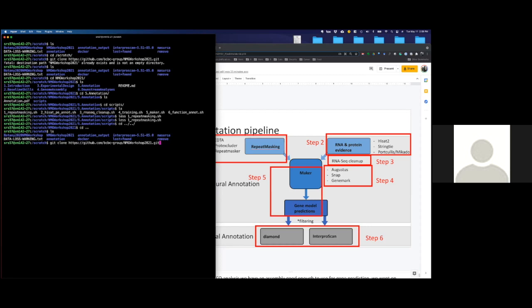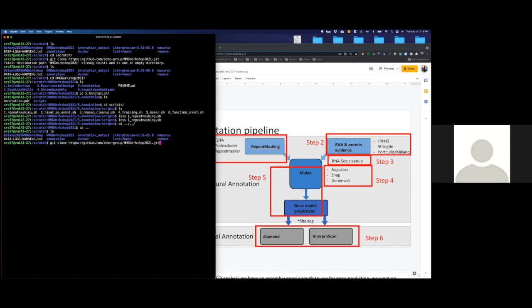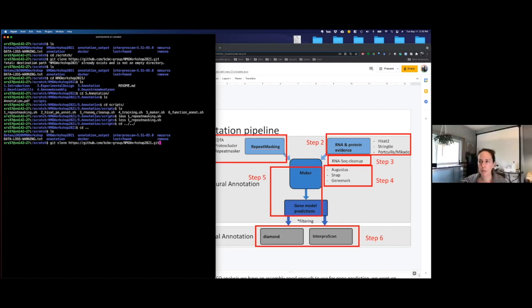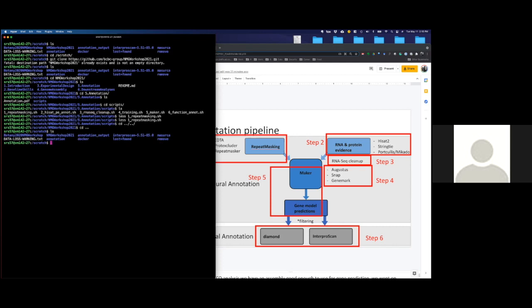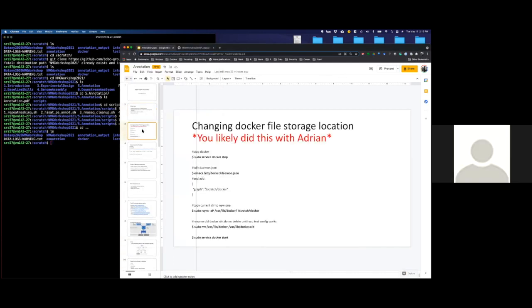So if I typed out, nothing's happening at the moment. If I just type out that command, the Control Z. Yep. We get FTP. Maybe the interpro scan. Yeah, let's go back to that. Was that supposed to work?